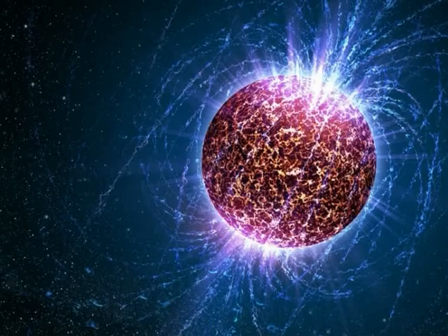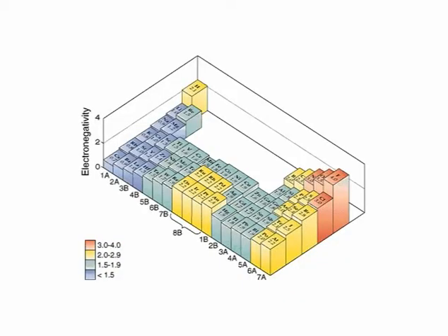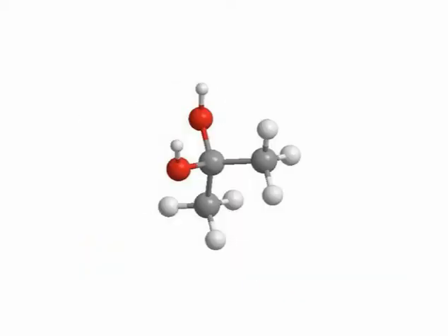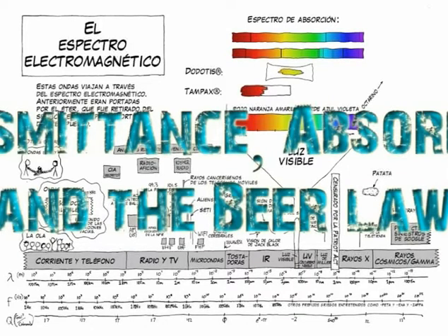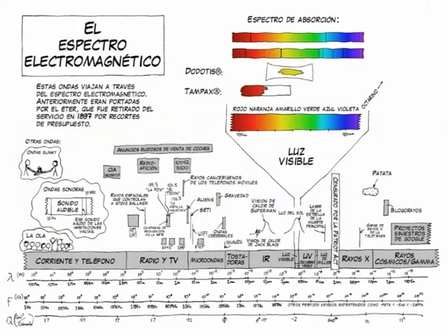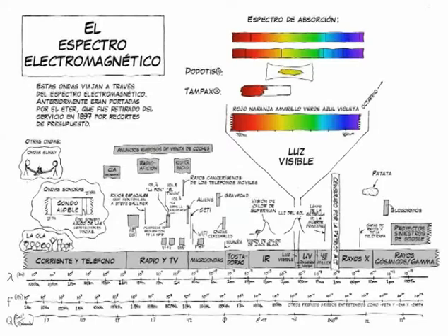This frequency depends on the atoms that form the bond and their electronegativity. This allows us to measure the absorbance at different light frequencies and so determine the active groups of the molecule. The term infrared covers the range of the electromagnetic spectrum between 0.78 and 1000 µm. It is useful to divide the infrared region into three sections: near, mid, and far infrared.